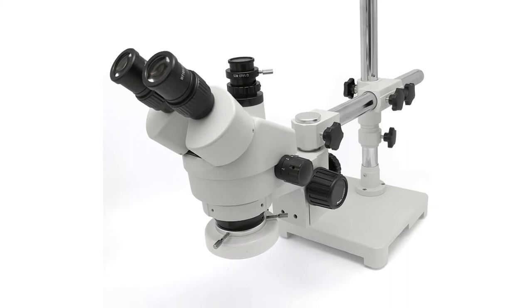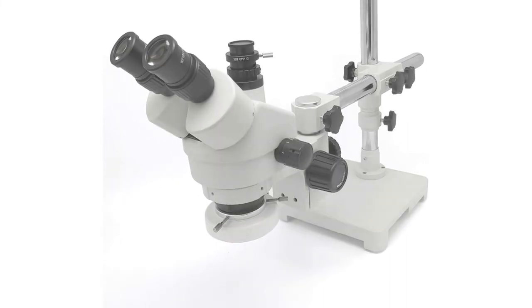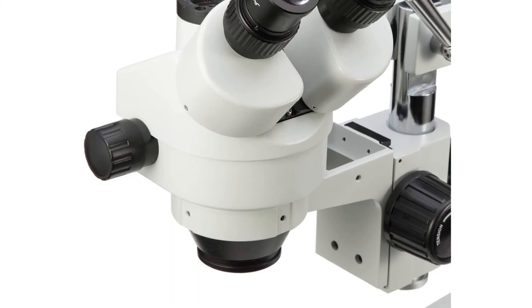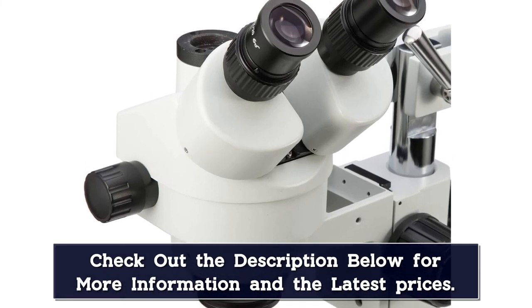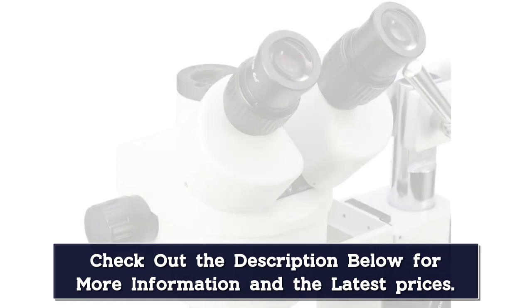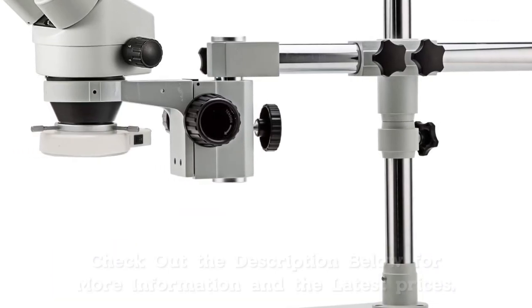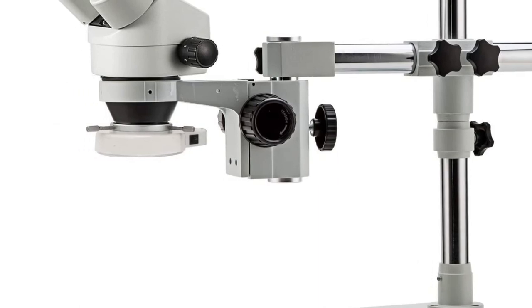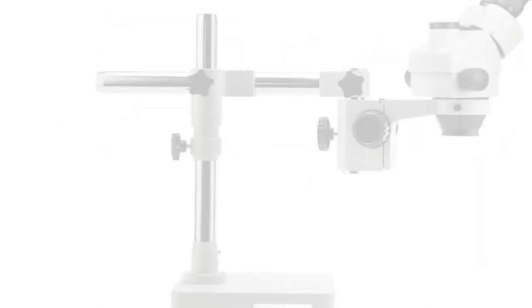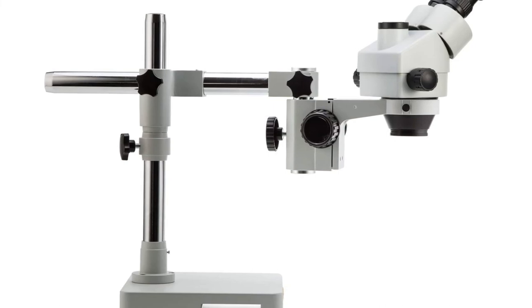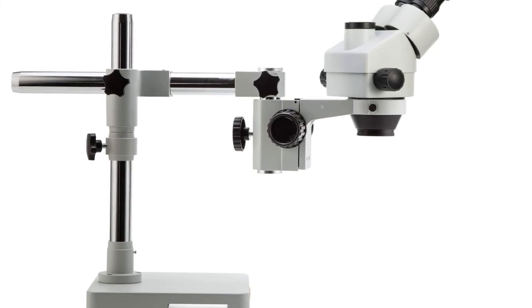The trinocular head is tilted at an ergonomic 45-degree angle to decrease eye and neck strain, includes a third port for an additional eyepiece or camera. Rugged construction with a sturdy metal base and swinging arm boom stand that allows for work with large objects. Includes a powerful 56-bulb LED ring light to flood the field of view with brilliant, shadow-free illumination cool enough for working with temperature-sensitive specimens.